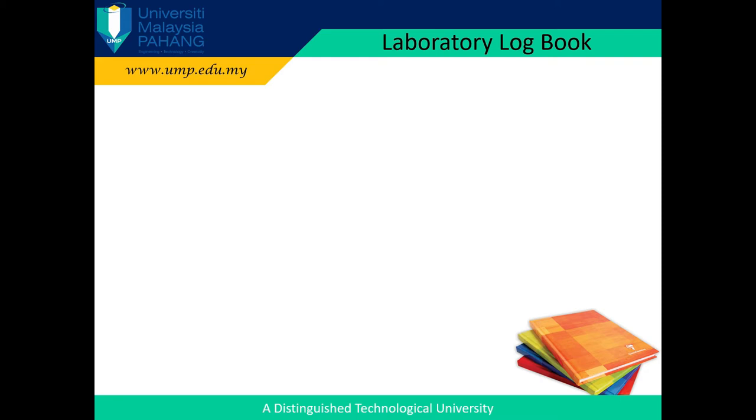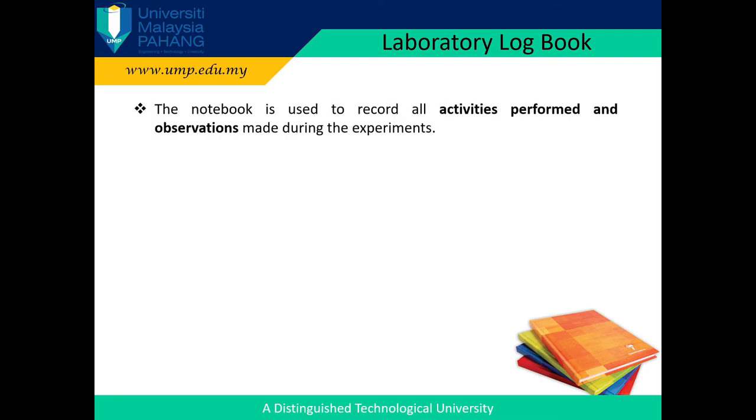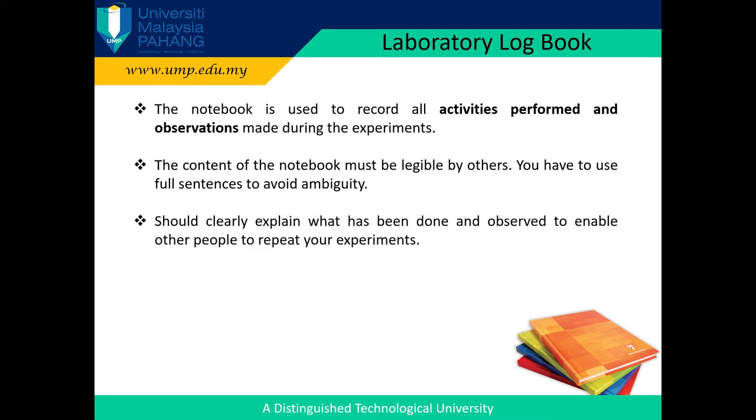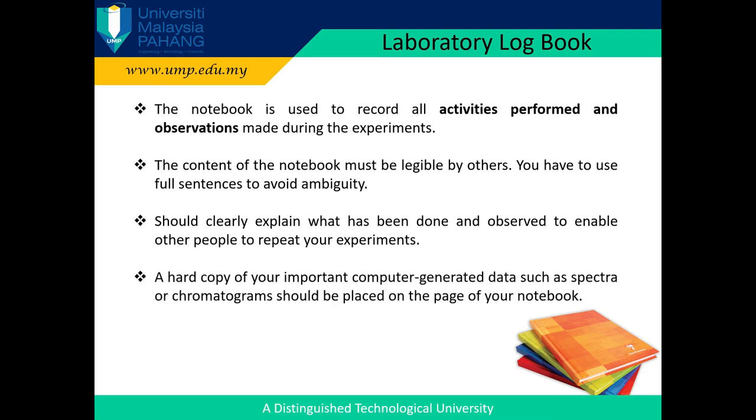Laboratory logbook. It is used to record all activities performed and observations made during the experiments. The content of the notebook must be legible by others. You have to use full sentences to avoid ambiguity. Should clearly explain what has been done and observed to enable other people to repeat your experiments. A hard copy of your important computer-generated data, such as spectra or chromatograms, should be placed on the page of your notebook.